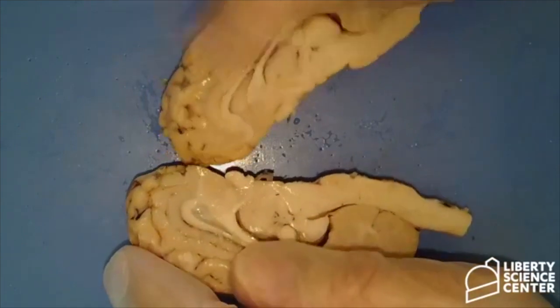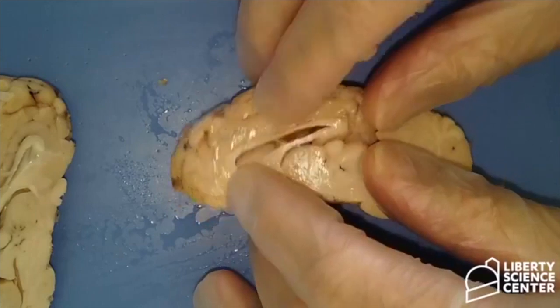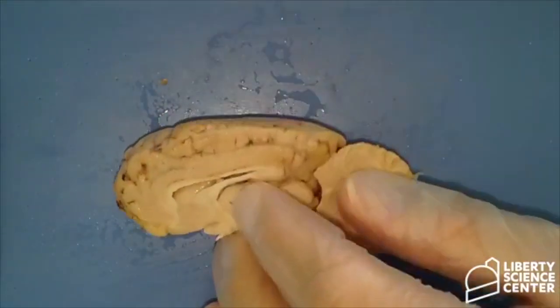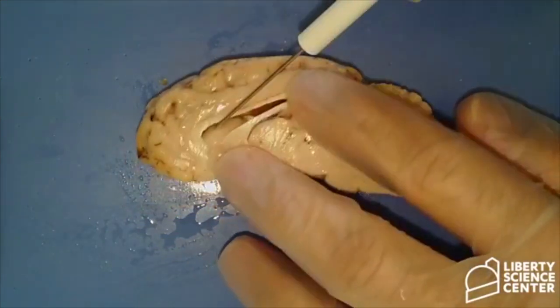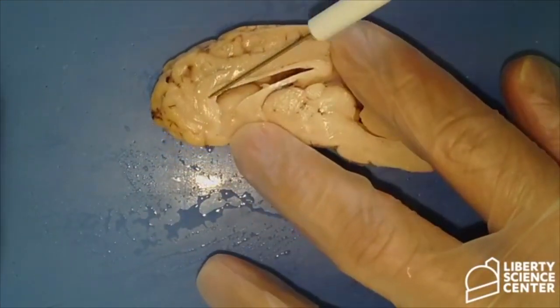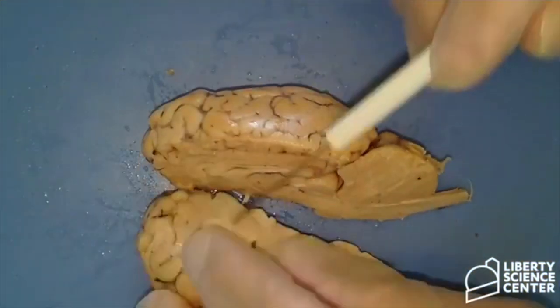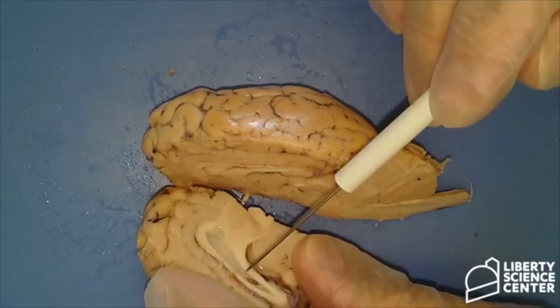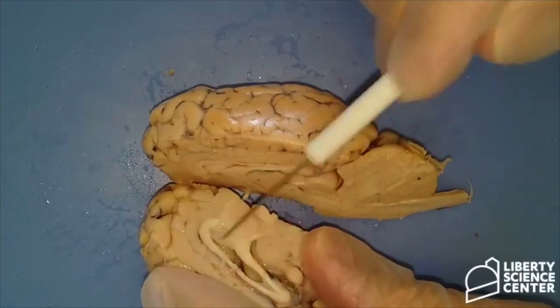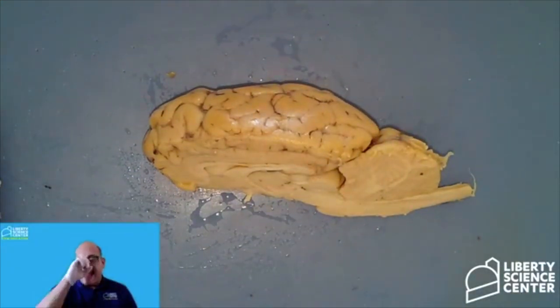Let's go with this side first, because we have a nice view of the ventricles. This is actually a beautiful view of the ventricles. You see this cavity right here? This is what we call the lateral ventricle. The ventricle is actually on the other side as well, so it's not as open here. Actually, I can open it a little bit right there. So that is a ventricle. There are four ventricles in the brain.